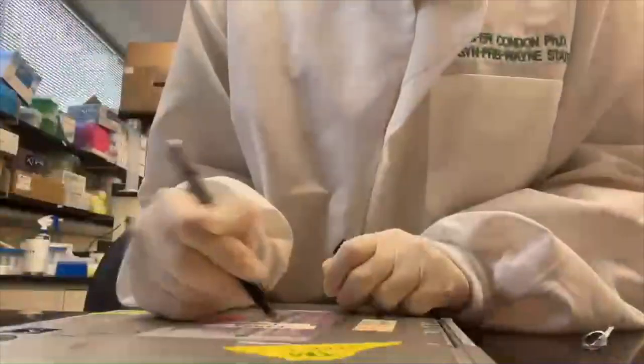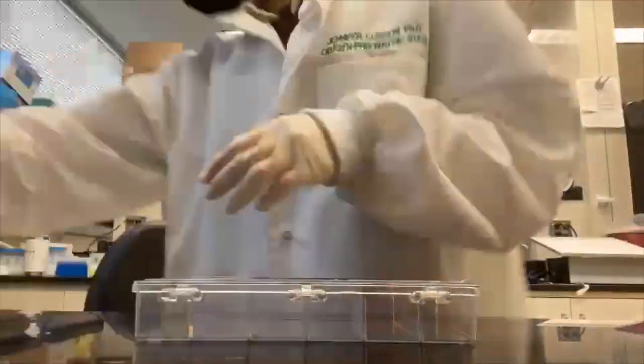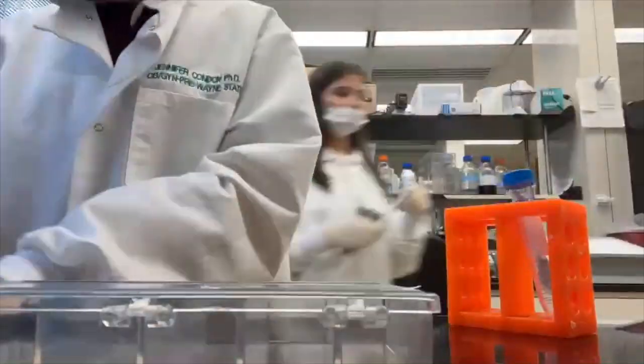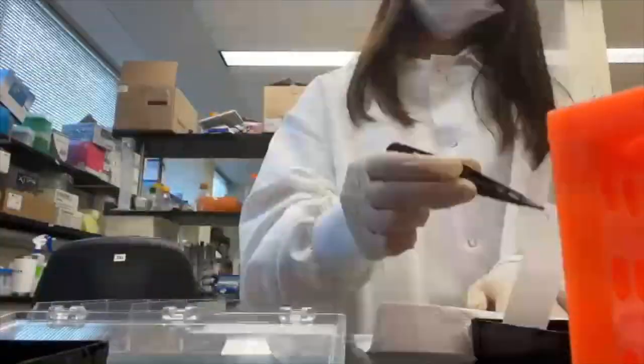This clip is showing the last few steps of Western blot. At this point, our membranes are prepared so that when we add chemiluminescence, the chemiluminescence will only bind to antibodies that are attached to the protein of interest. This clip shows us getting the chemiluminescence ready and also applying the chemiluminescence to the membranes.